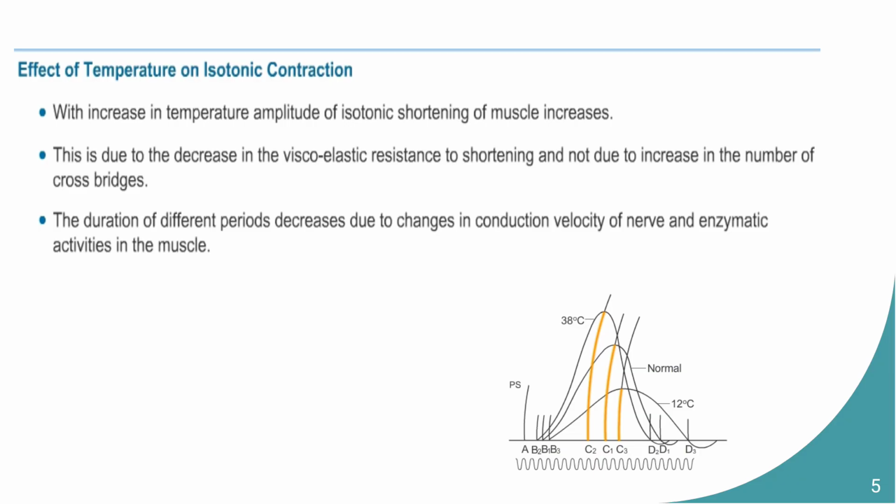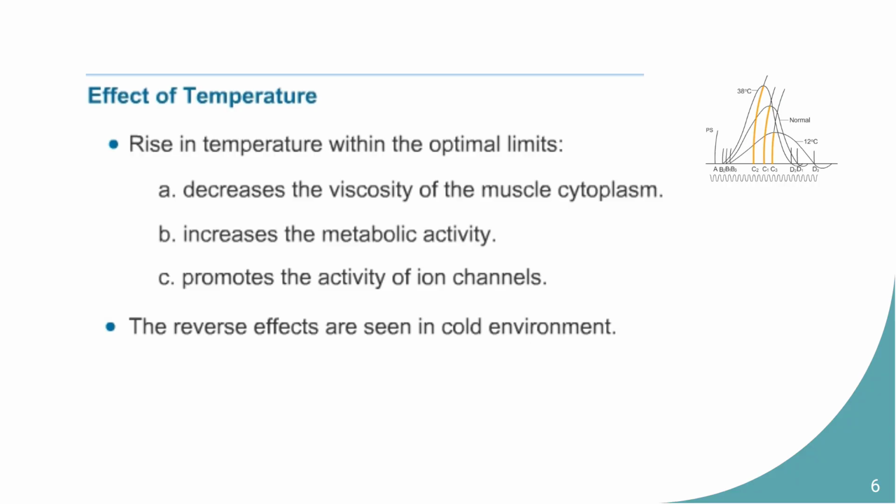Okay, so if we increase the temperature, there will be two changes. One, the force or height of contraction will be increased, and secondly, the duration of all these phases will be shortened, and the reverse will happen in case of cold temperature. So why these kind of changes are happening here?